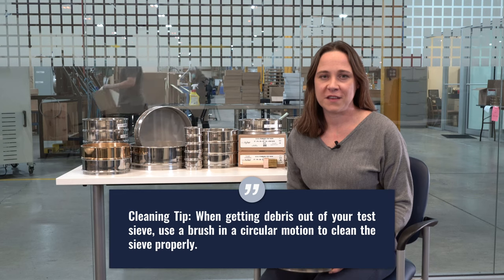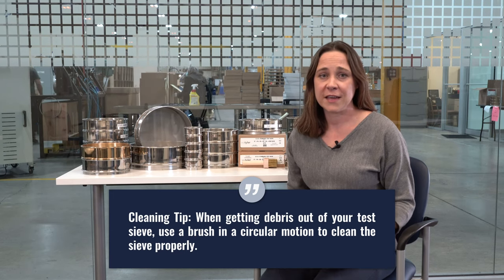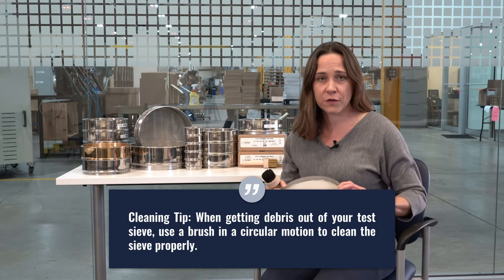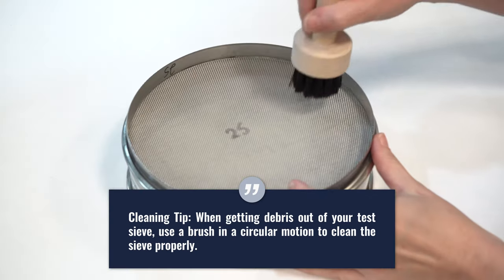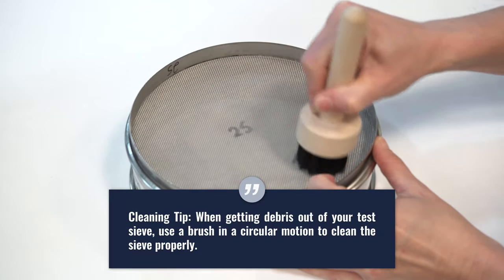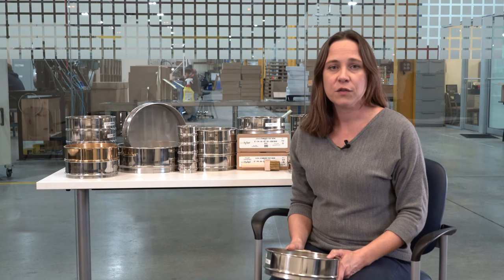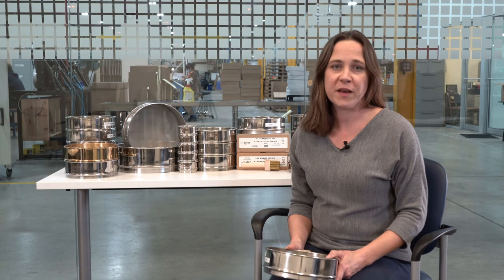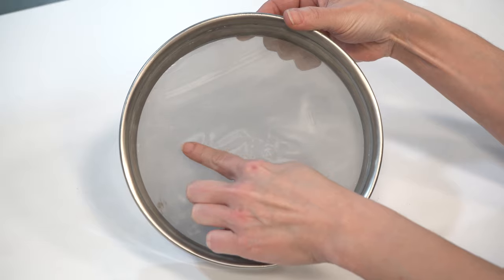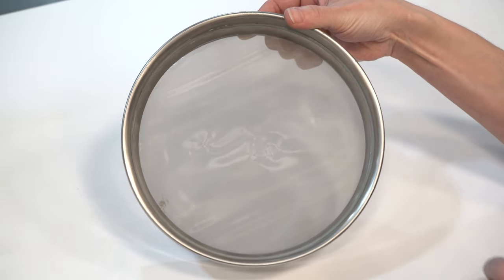It's important to properly clean your test sieve after each analysis that you run. When you're done with your test, take each test sieve, flip it over so that you can see the underside, and take a brush moving in circular motions to free up any debris that might be stuck in the openings. For fine mesh sieves, typically 100 mesh and smaller, using a soft bristle nylon brush is your best bet. Make sure that you use a light touch because if you push too hard and damage the mesh, it'll affect your sieving results later on.